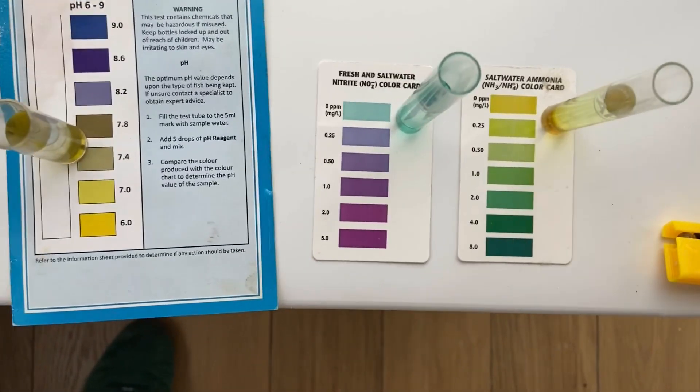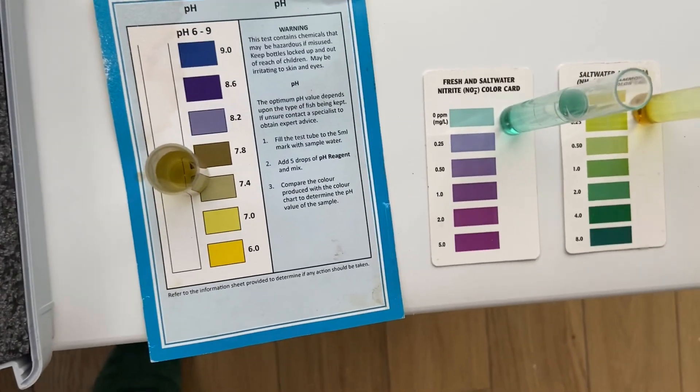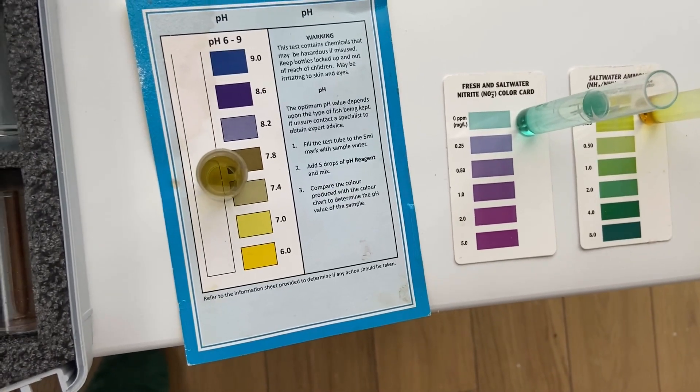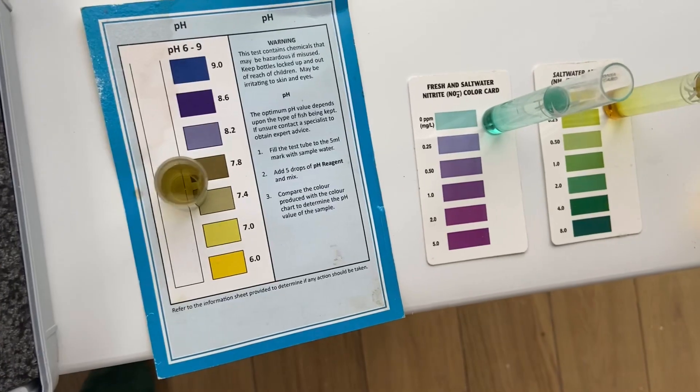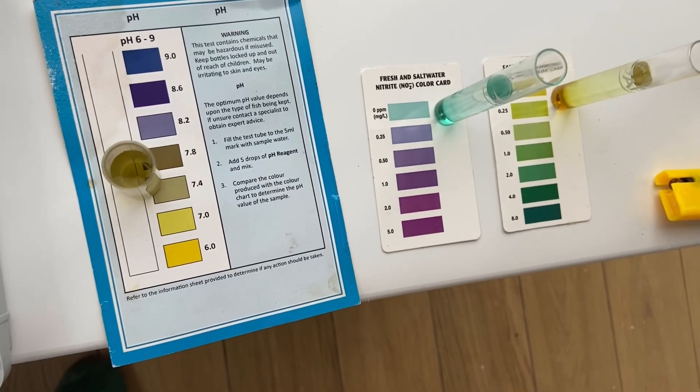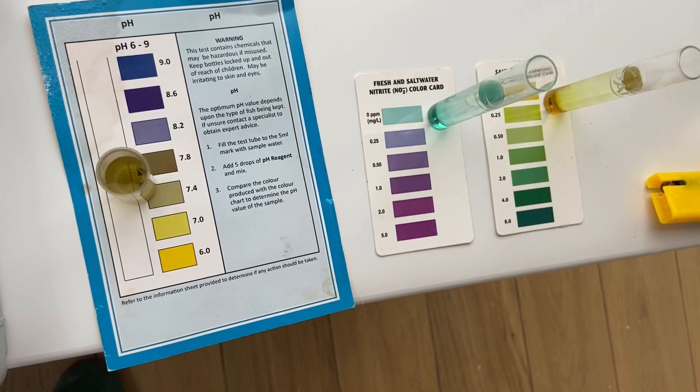And then I do the same with my pH. It's a job to tell exactly but it's in the sevens — probably 7.4.